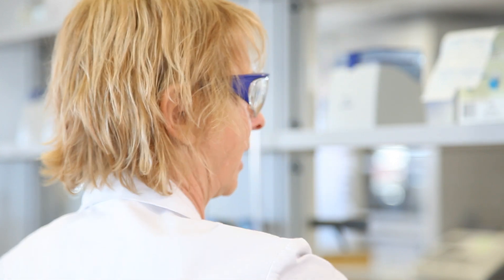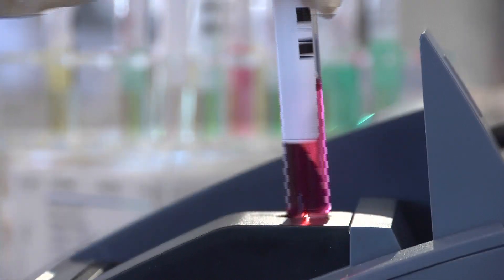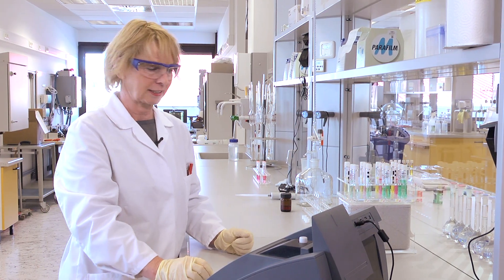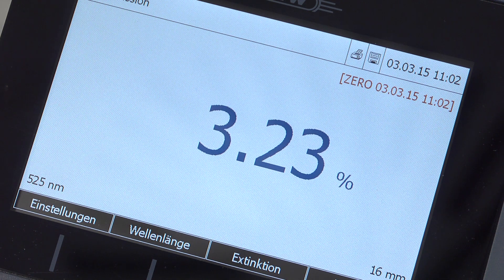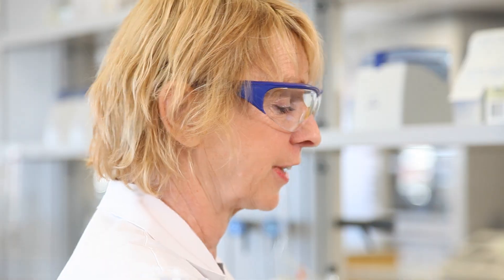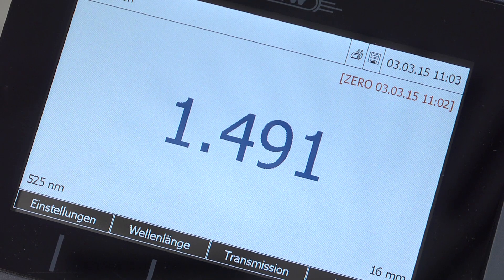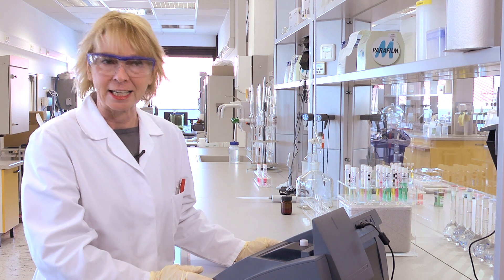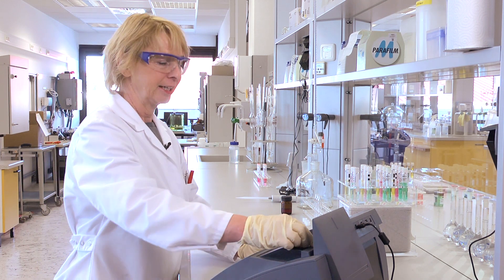This behavior changes in a colored solution. Choosing a red solution, we take a reading at 525 nanometers. A reduction of almost 97% and nearly 1.5 units — the substance sort of traps the light in the cuvette.